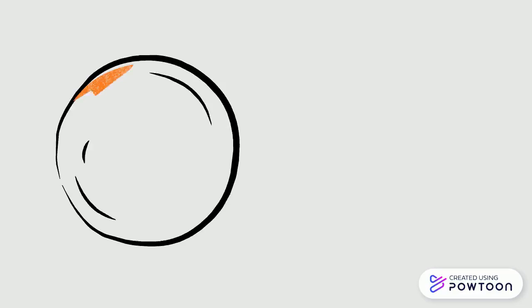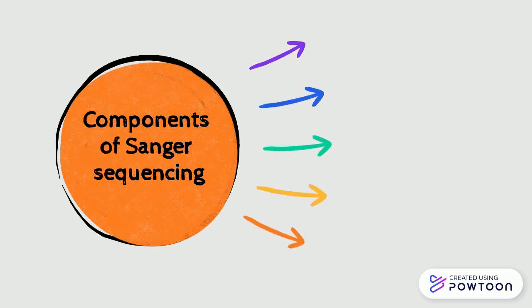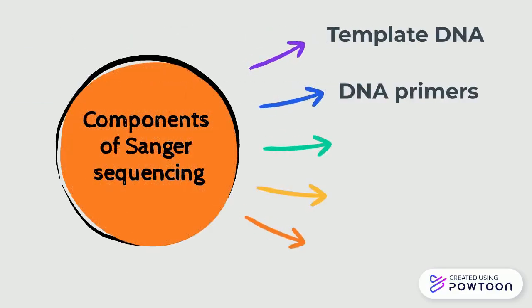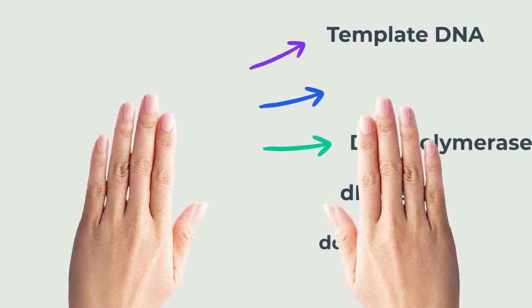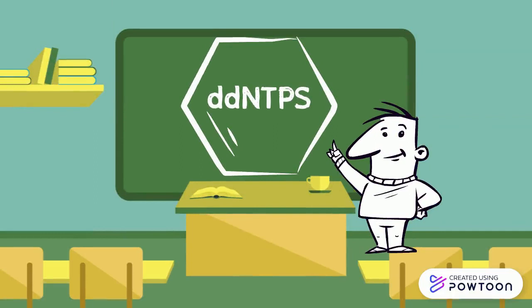The basic components required are amplified DNA template, DNA primers, DNA polymerase, deoxynucleoside triphosphates called dNTPs, and a modified dNTP called dideoxynucleoside triphosphate, ddNTP. ddNTPs do not have the 3' hydroxyl group that allows a phosphodiester bond to form with the 5' phosphate on another nucleotide to form a chain. This results in termination of the elongation of the DNA template at the site of ddNTP insertion.